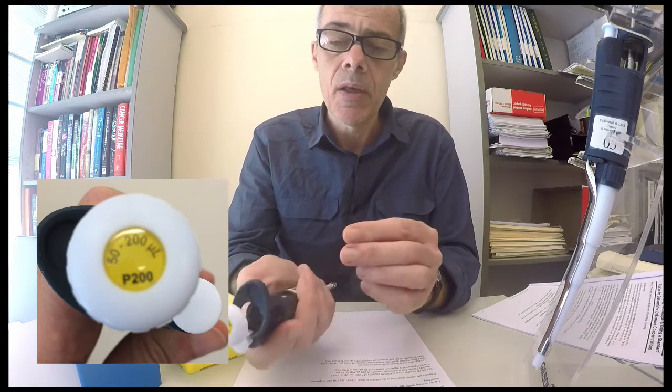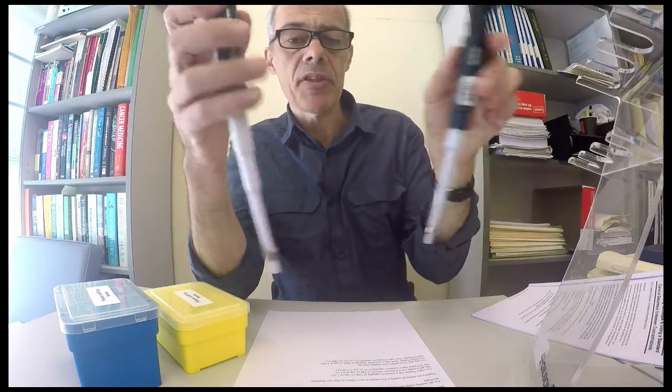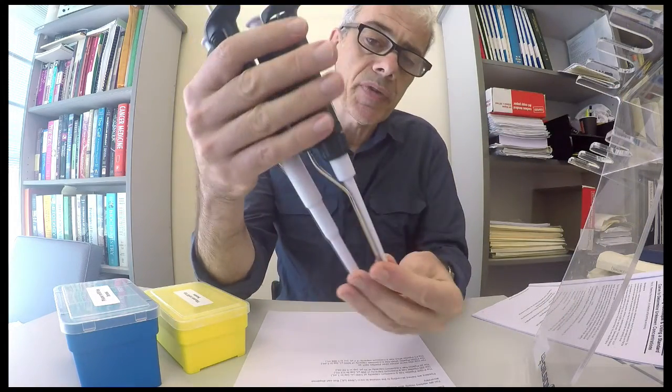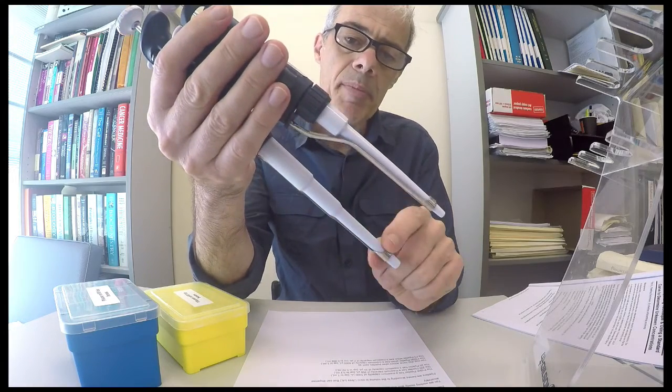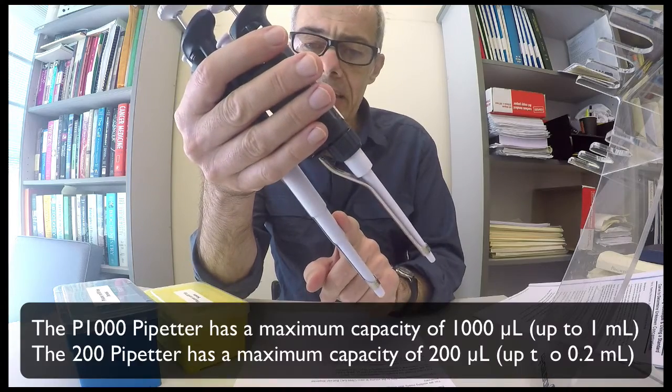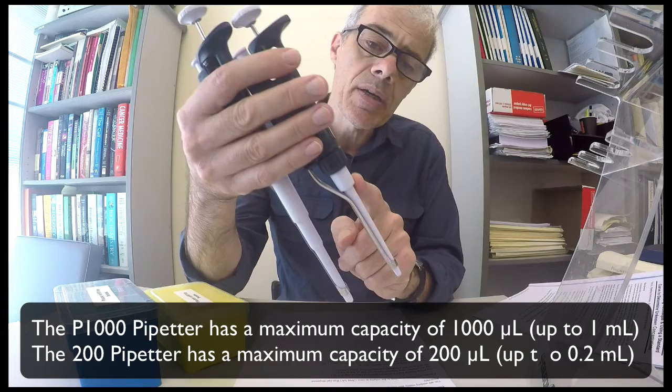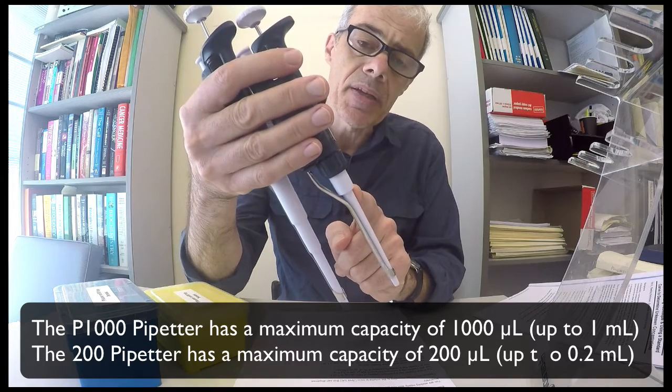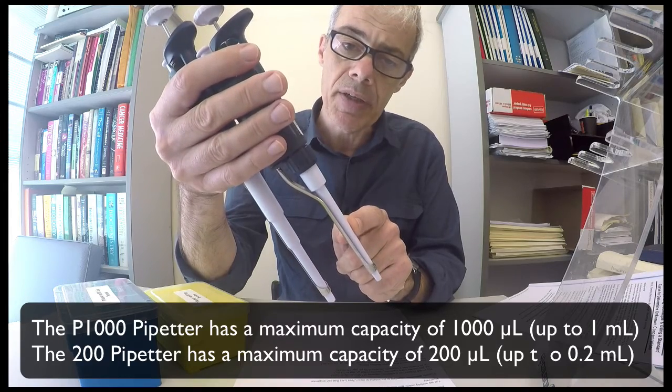If you look at these in comparison, you can see straight away the difference. This pipette here has a much wider barrel and can dispense a much larger volume up to a millilitre or 1000 microlitres. This one has a much narrower barrel and can dispense a smaller volume up to 0.2 of a mil or 200 microlitres.